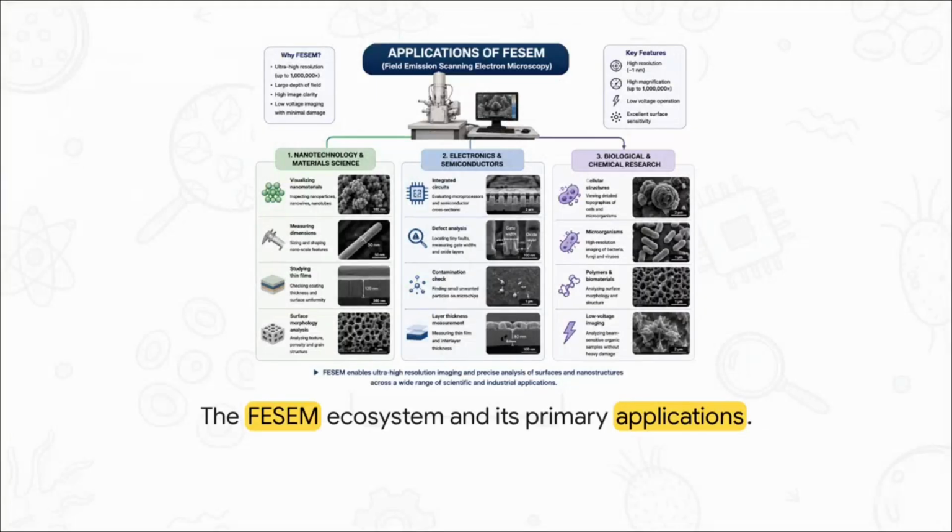It doesn't just show you that something is vaguely there, it shows you exactly what its surface feels and looks like. And this brilliantly illustrates how the FESEM is the undeniable nexus for modern multidisciplinary science. It sits right there as the central hub for innovation across nanotechnology and materials science, electronics and semiconductors, and biological and chemical research. The FESEM isn't just some niche tool. It's literally the engine driving massive breakthroughs across these entirely distinct domains.